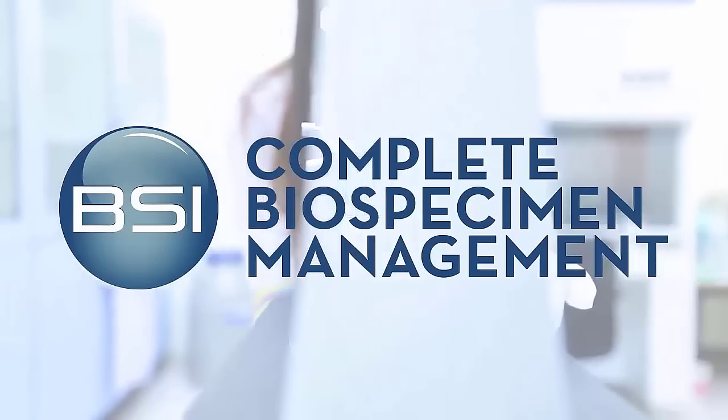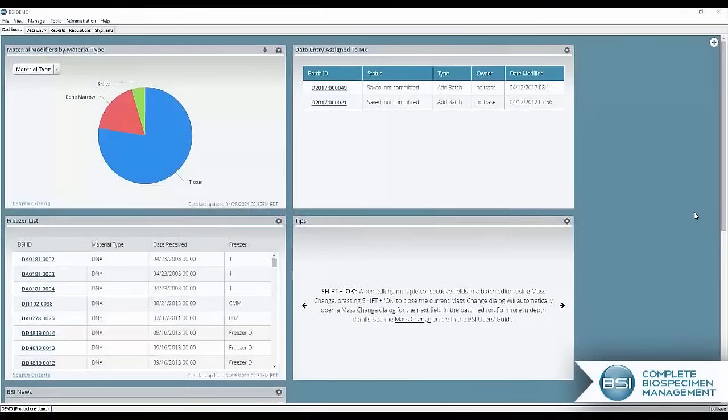First, I would like to tell you a little bit about BSI. BSI is a powerful web-based specimen management software. It has been in production since 1998 and has been evolving ever since. The system is used by government agencies, biorepositories, hospitals, universities, and pharmaceutical companies.